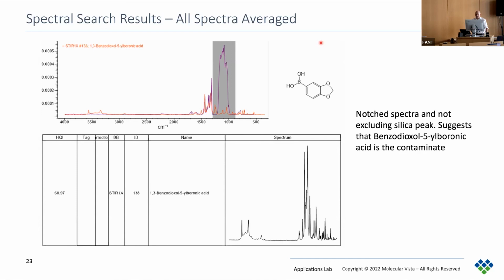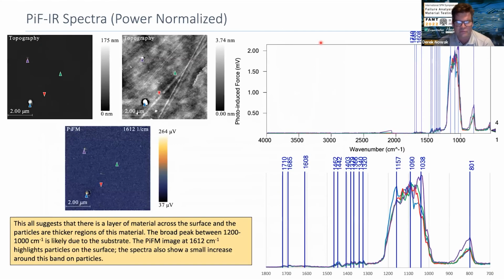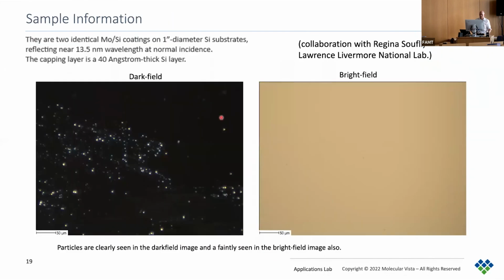Which one would you use? I mean, are you talking about from just looking at the spectra themselves or the AFM images? If you look at the chemical distribution of a certain substance, let's say you want to see the PMMA distribution. Oh, I see.